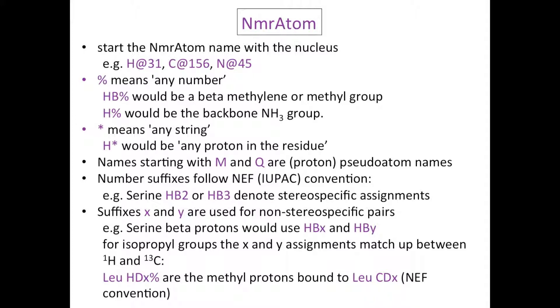For isopropyl groups, the X and Y assignments match up between 1H and 13C. So leucine HDX percent are the methyl protons bound to leucine CDX.